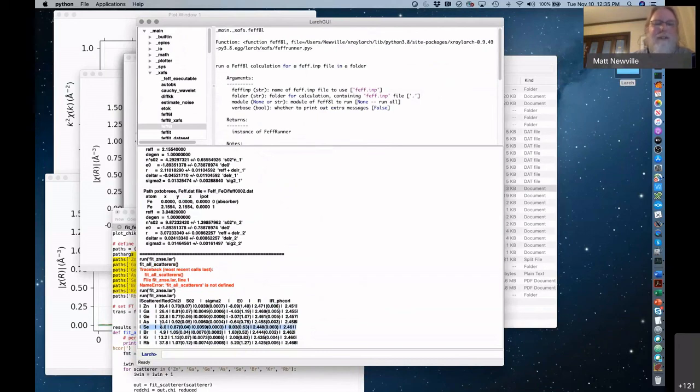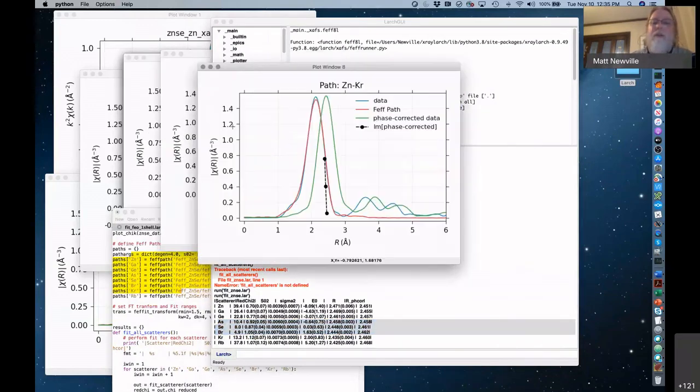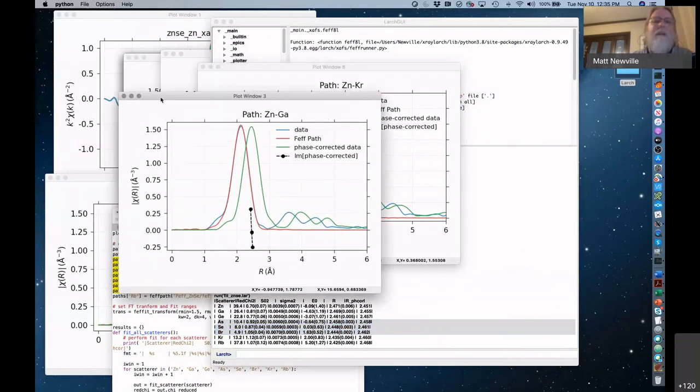Maybe arsenic is not so bad either. So it might be challenging to tell these two. But you can sort of tell that it's plus or minus 3 or 5. It's hard to tell the difference between them. Like, I'll just show you some of them. It's the red curve versus the blue curve that is the fit. I'll get to what the green curves are in a second.